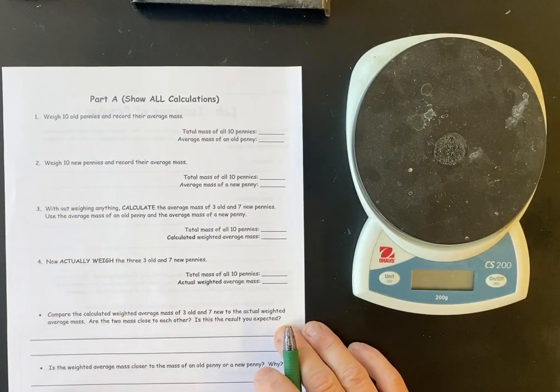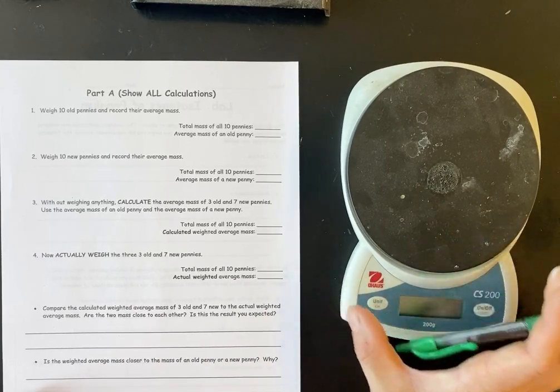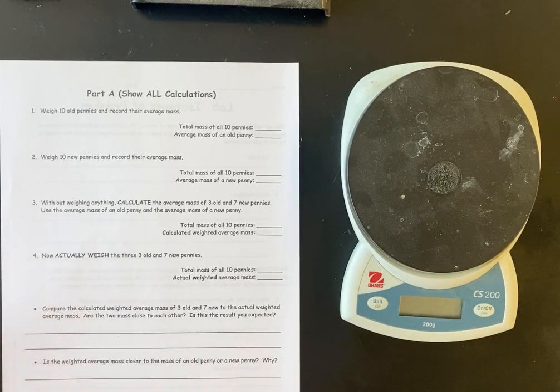Now, for the lab, part A. Part A is pretty simple. You're going to have to figure out the average weight of an old penny, the average weight of a new penny. It's not that hard. So here's what's going to happen.